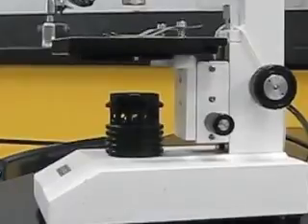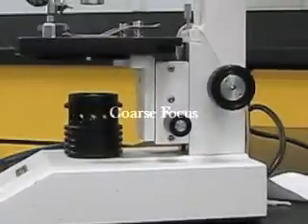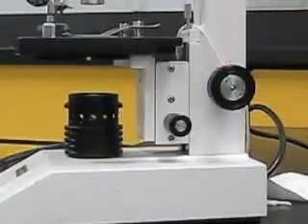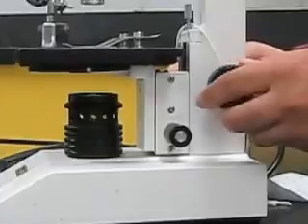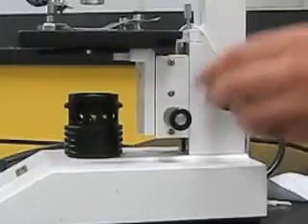The coarse adjustment knob is found underneath the stage on the back of the microscope. This is the larger of the 2 round knobs found. The coarse adjustment is going to move the stage up and down, giving the viewer large changes in the field of view.